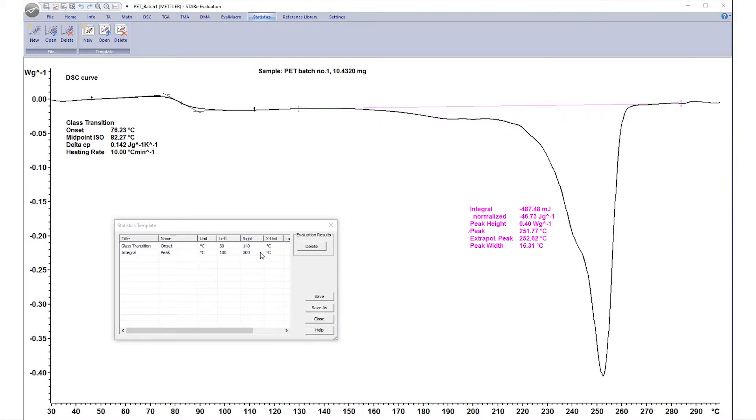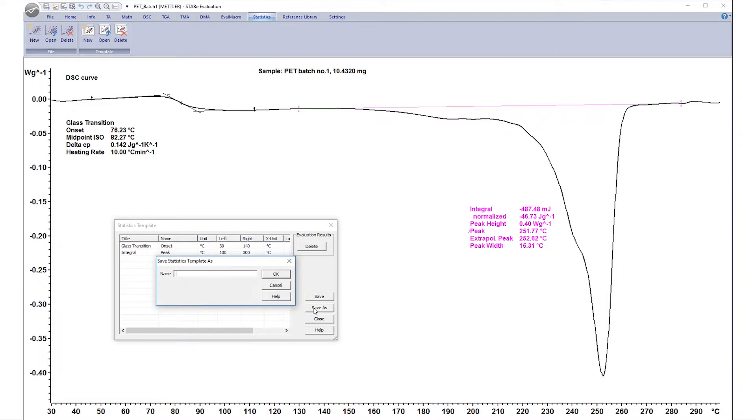Repeat these steps if you wish to include additional results. To save the template, click Save As, enter a template name, and click OK.